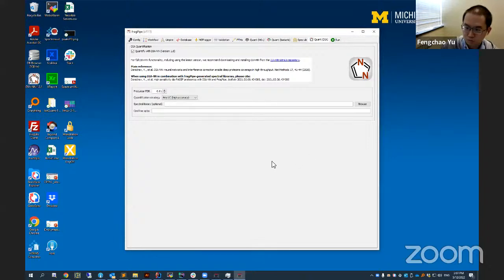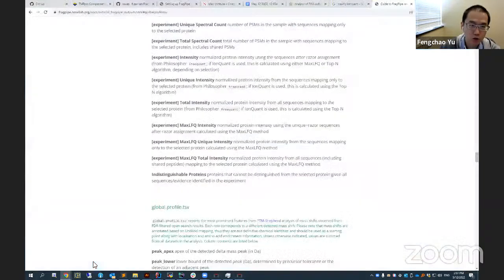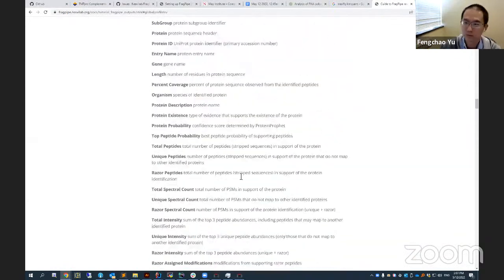Okay, so I think I pretty much finished the DIA workflows here. And there are some others like the label workflows, single-cell workflows. I will skip them, and feel free to have a look and try. If you have any questions, just remember, go to the GitHub page.